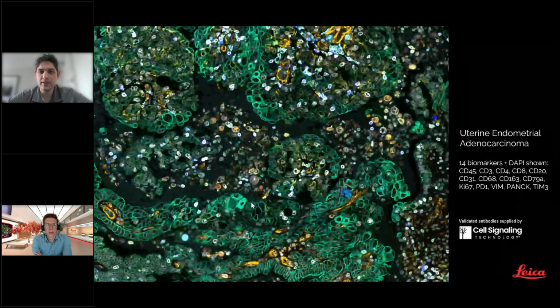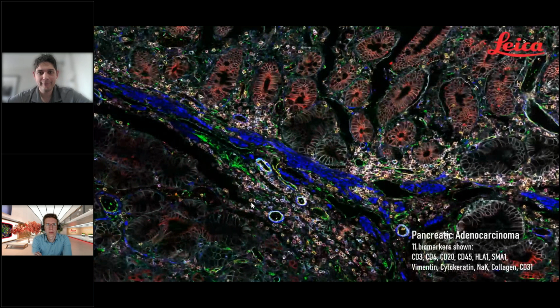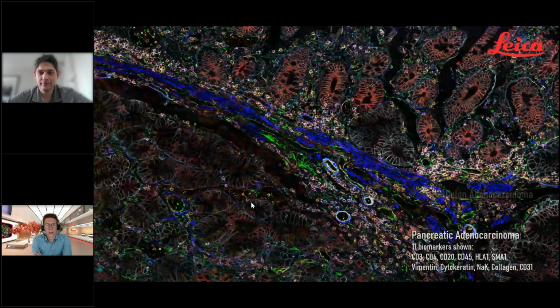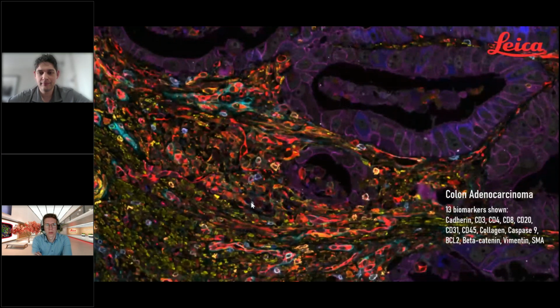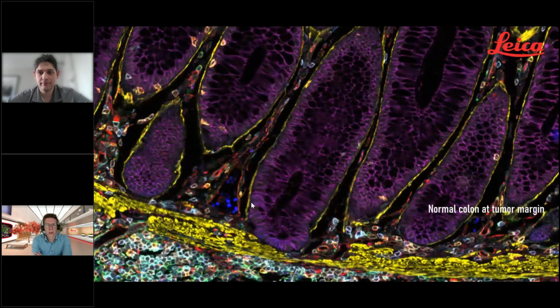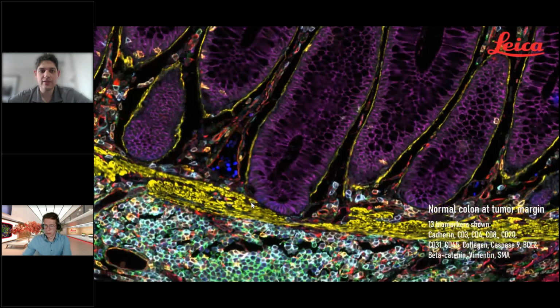Like I said before, it's a subcellular resolution. So there's a tremendous amount of detail that can be accessed using a CellDive.